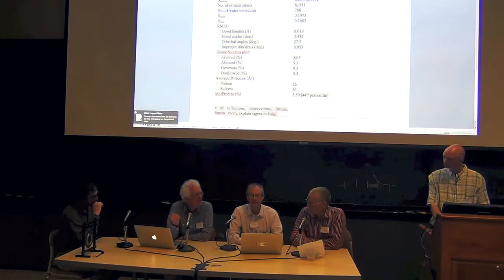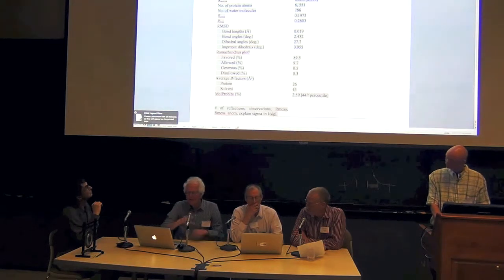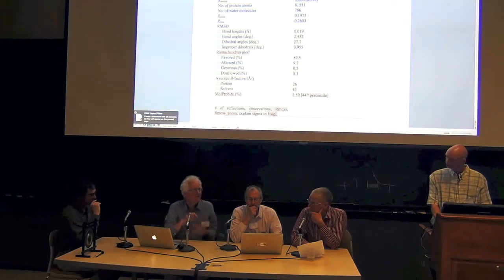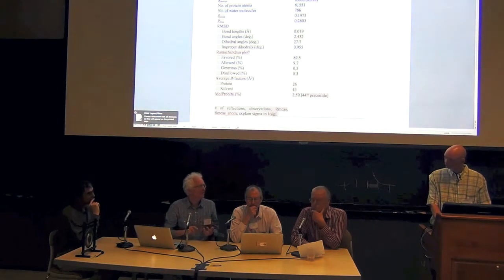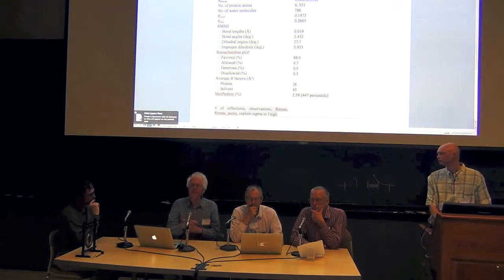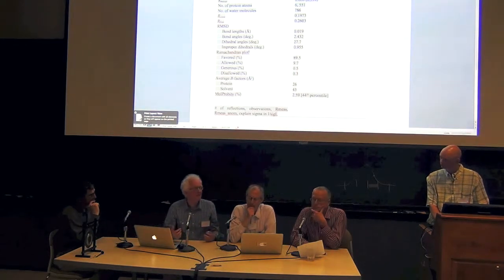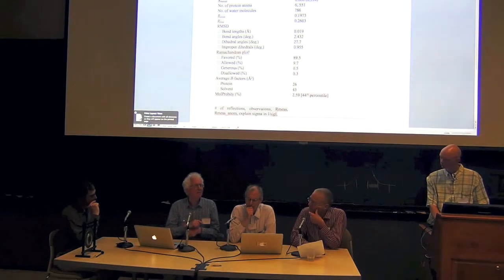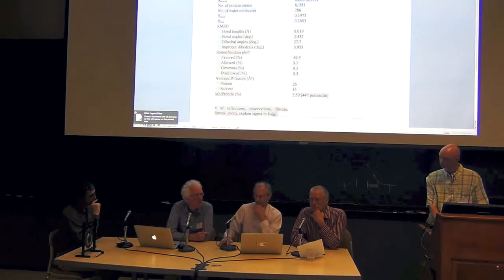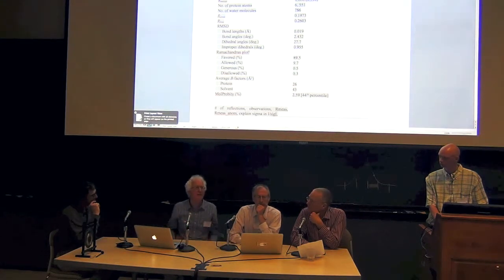As far as the reader is concerned, the main purpose of the statistics you've got on the data processing is to show whether this is a good data set or a bad data set. And the trouble is, this doesn't distinguish between somebody who's made the best of a bad job, who got a pretty bad crystal set and managed to extract something decent out of it, and another author who really has been a bit casual about the data, maybe rather wishful thinking about what they can extract.